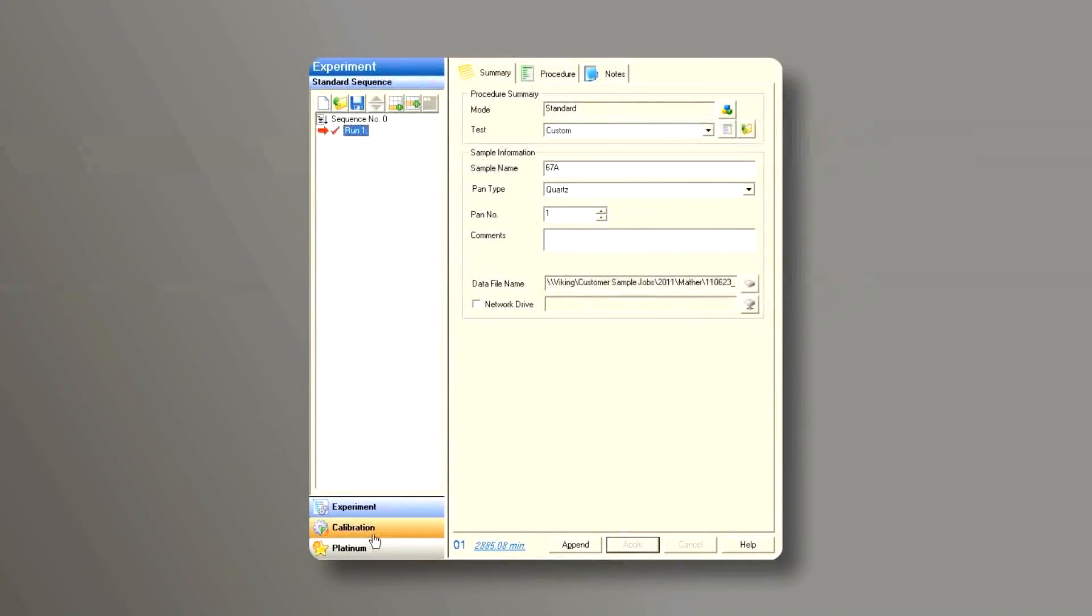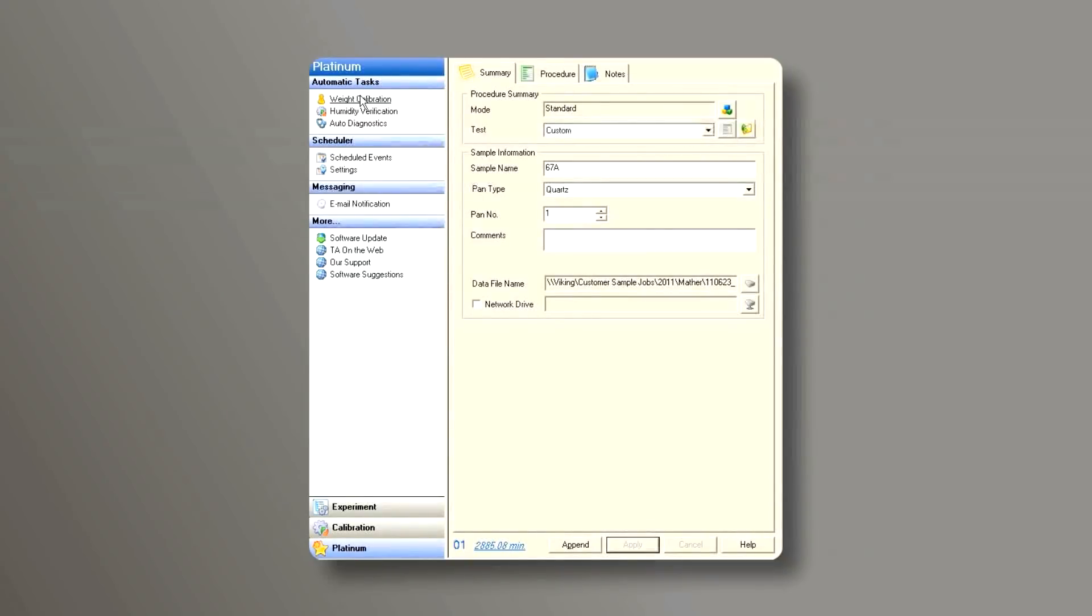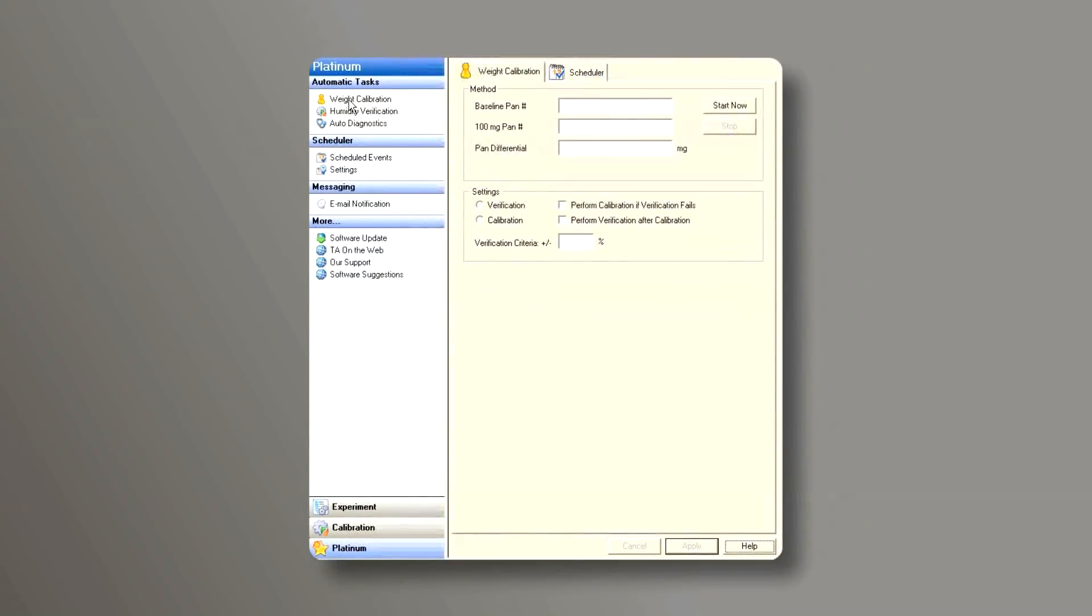First, let's go to Platinum in the instrument control window. Click the automatic task and press weight calibration. Click the weight calibration tab.